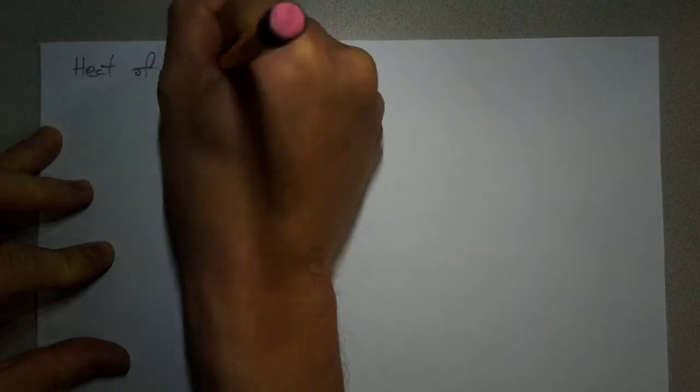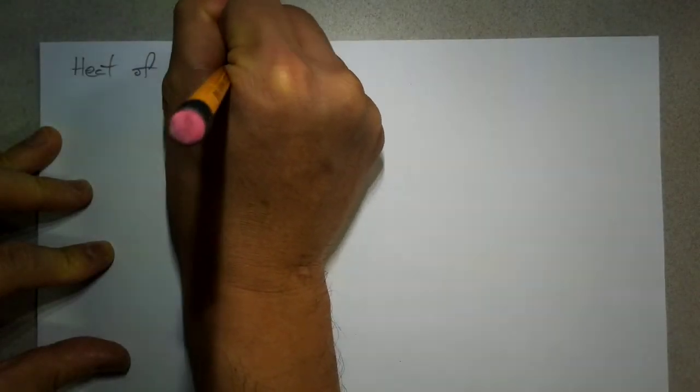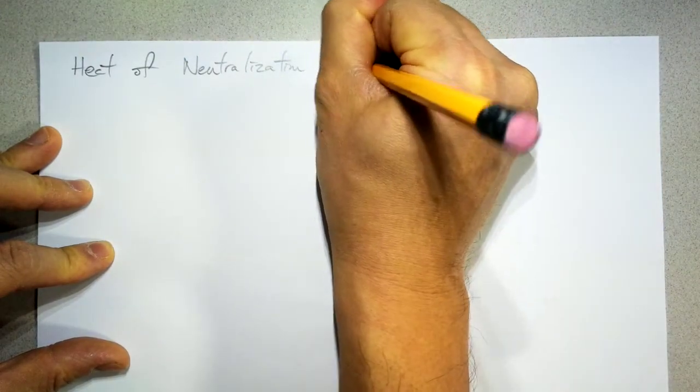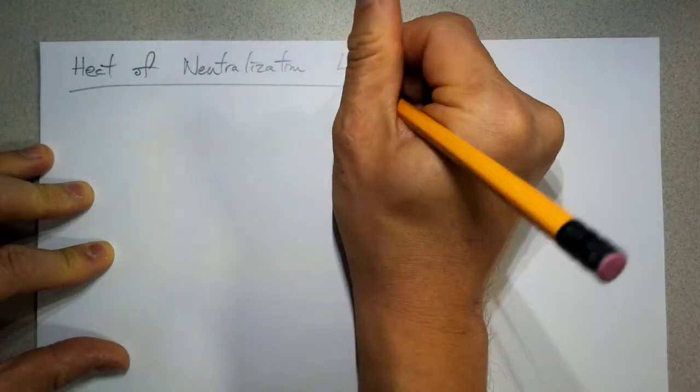What we're doing today, we are actually doing a lab. We're going to be calculating and measuring the heat of neutralization. So write this down, copy this down: the heat of neutralization lab.